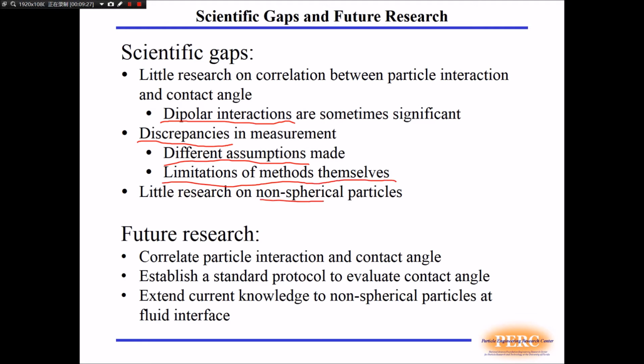Non-spherical particles have unique properties and have become of interest in recent research, but there is little research on how to measure their contact angle. Based on these scientific gaps, we suggest that future research should focus on correlating particle interaction and contact angle, establishing a standard protocol to evaluate contact angle, and extending current knowledge of spherical particles to study contact angle of non-spherical particles at fluid interfaces.